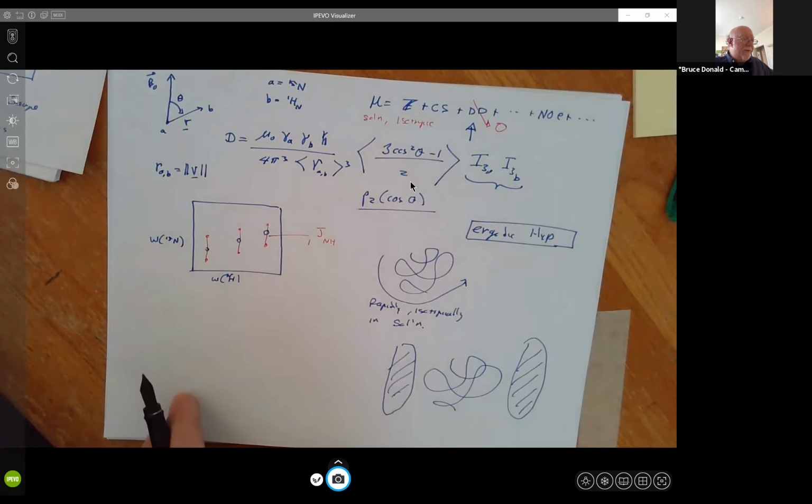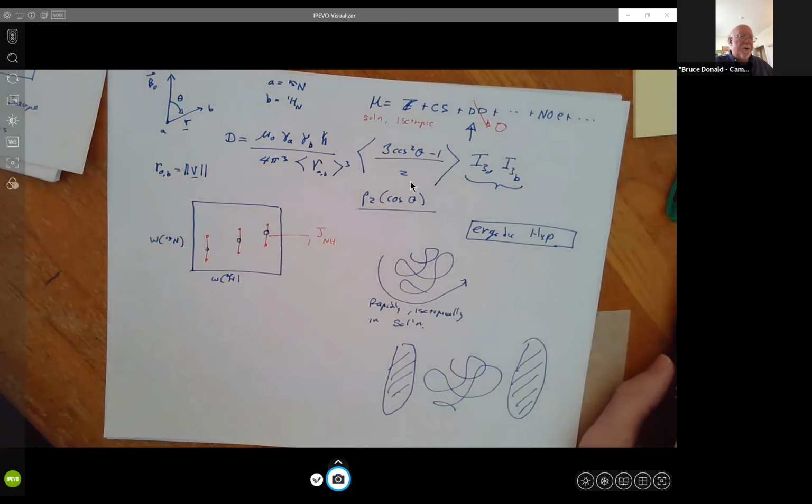So you actually titrate these in, you have rules of thumb, and you titrate these in until the RDCs are between about plus or minus 30 hertz typically, or plus or minus 20 hertz. So a small signal, but highly significant. And there are lots of ways of doing this. Aside from titrating in phage or bicells, there are actually 50 or 60 different aligning media.